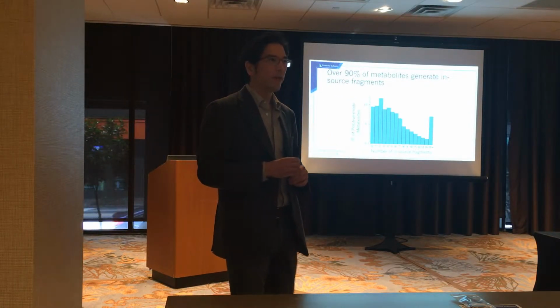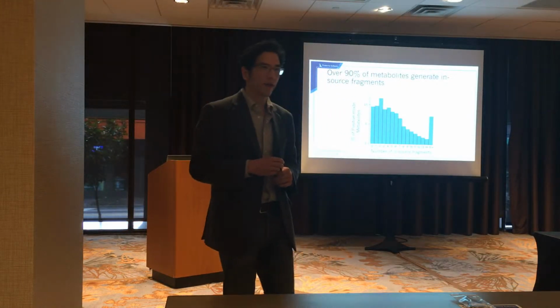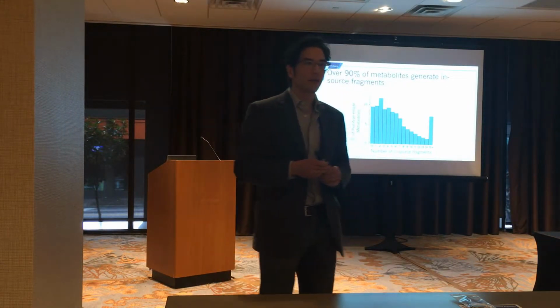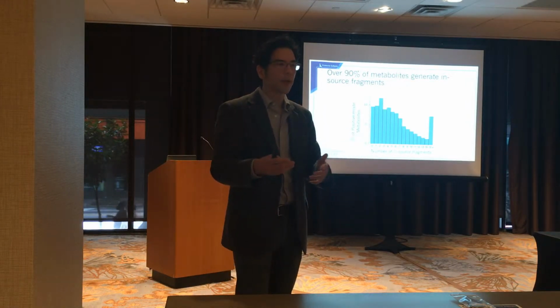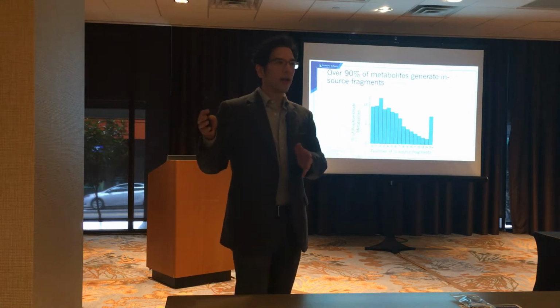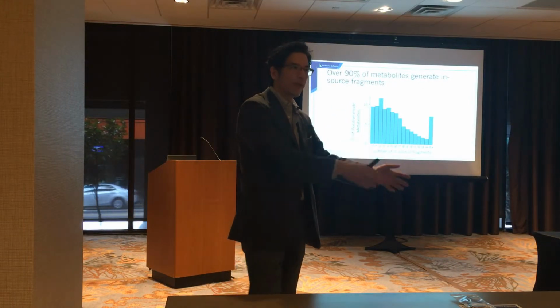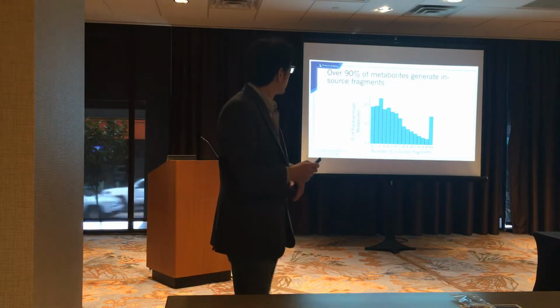He noted that over 90% of metabolites actually showed some signature for an in-source fragment, which is kind of disheartening, because that means we're going to double our potential false positive rate: there's going to be another number of metabolites that produce fragments that are detected as other metabolites, because they'll have a different precursor mass.